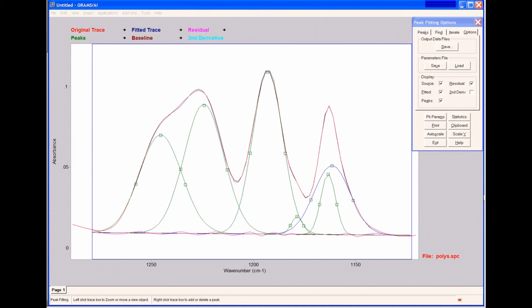If I decide I would like to use this peak fitting statistics again, perhaps I have many different samples to analyze in the same region and I want to find those peaks in all of my samples. I can save the parameters file.